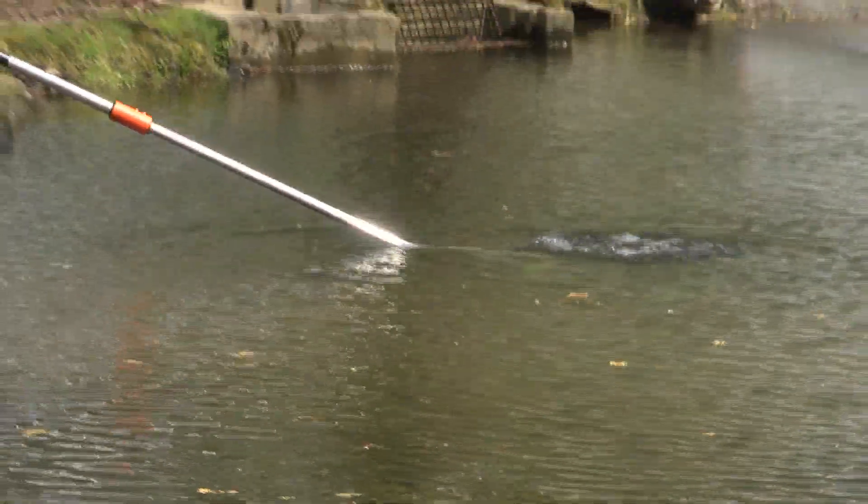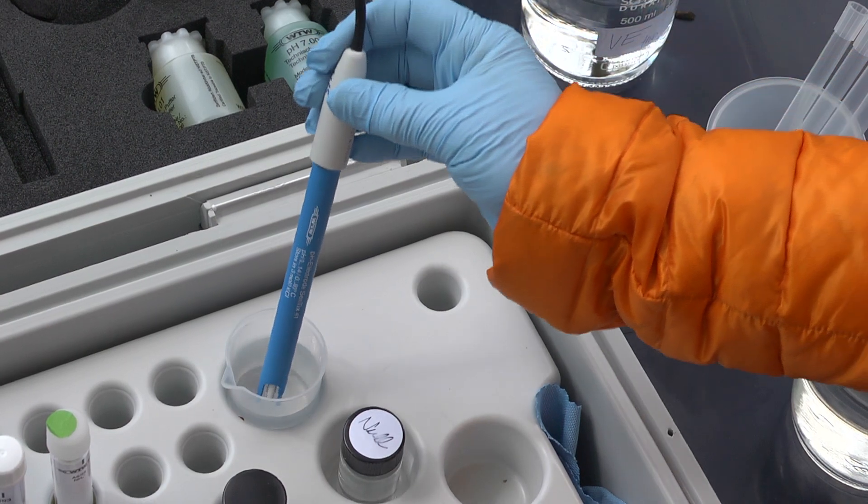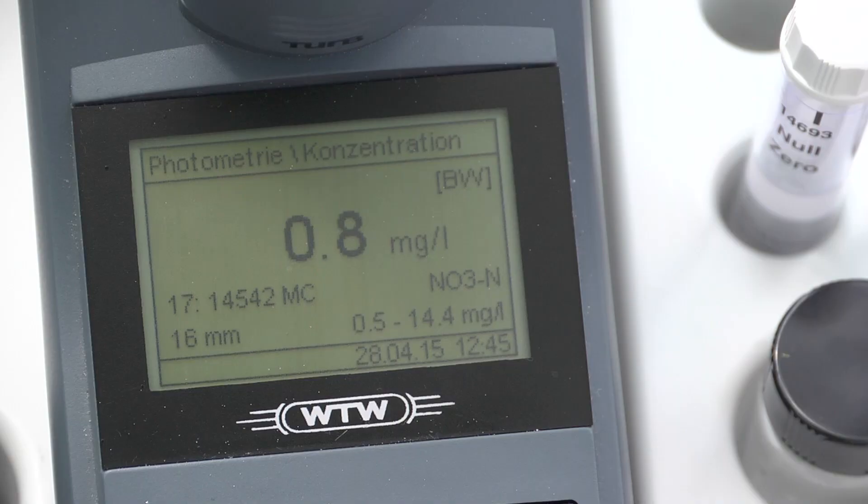In fish farming, important parameters are free ammonia and nitrite, as they can be poisonous for fish. We can use this meter to carry out a combined ammonium and pH measurement, thereby determining the free ammonia in the sample.